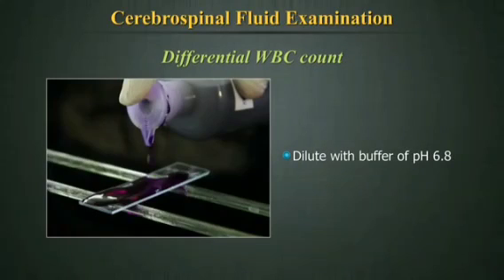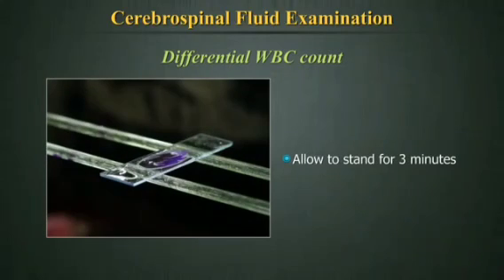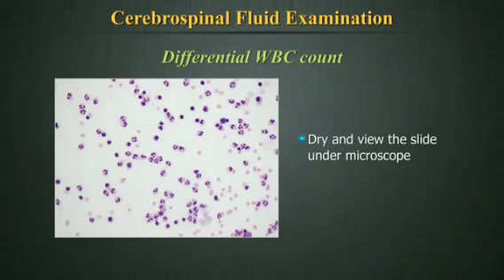Dilute with buffer of pH 6.8 and allow to stand for 3 minutes. When dry, view the slide under microscope and do the differential count of WBCs.